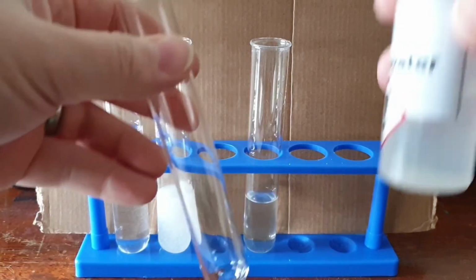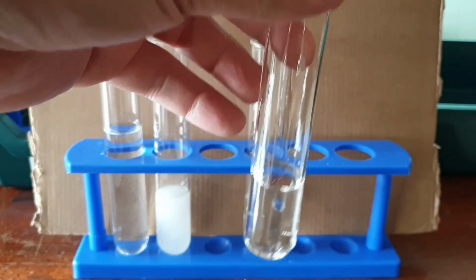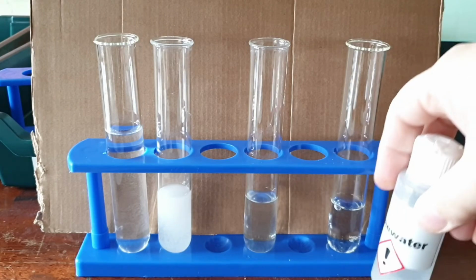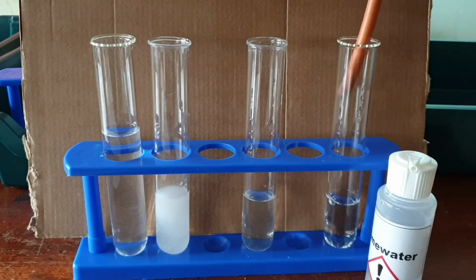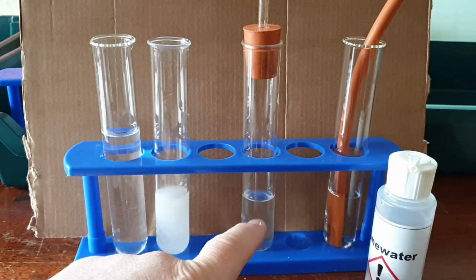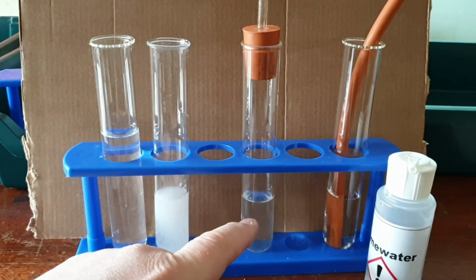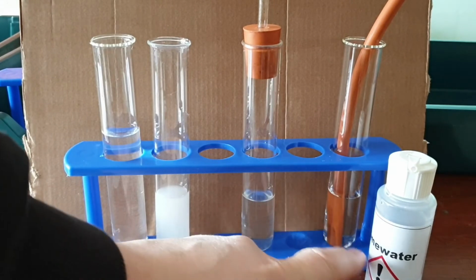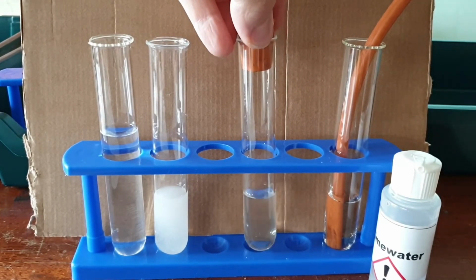So I get my test tube and some lime water. I'll chuck some lime water in there. That is lime water, and I'll leave that there just so you can see. The idea is I stick a tube in the bottom of that one and a bung in the top. I need to add the acid first. If I add the acid, the only gas that could be evolved is if that's a carbonate, and then the gas would be carbon dioxide, and to check it's carbon dioxide, I'm bubbling it through lime water. It doesn't matter what acid you use for this one, anyone will do.